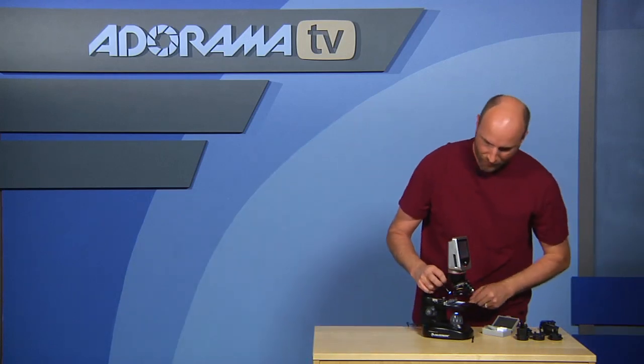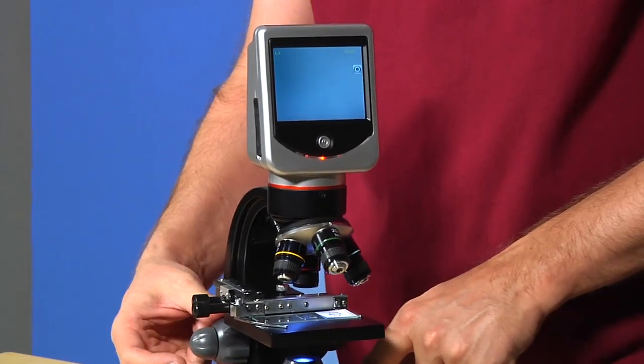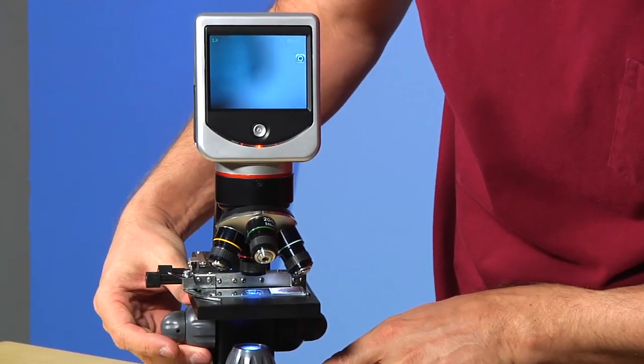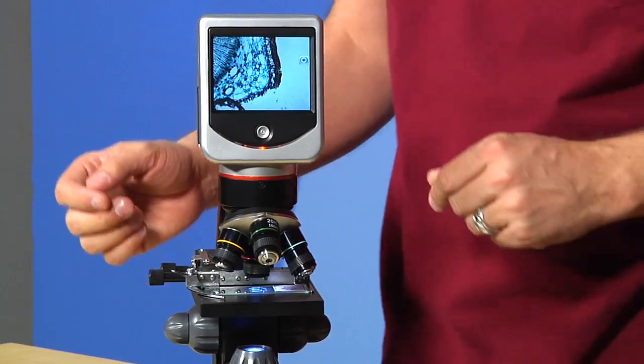On the side there are two knobs. The rough adjustment knob lets you move the slide up and down to get focus, and then you have a fine adjustment knob so once you get it pretty close you can fine-tune it. I'll get this really close — there it is — and then I'll just fine-tune it. Voila! Now I can see what's on my slide.